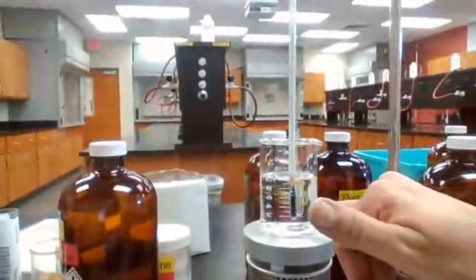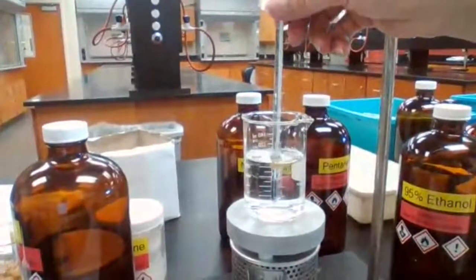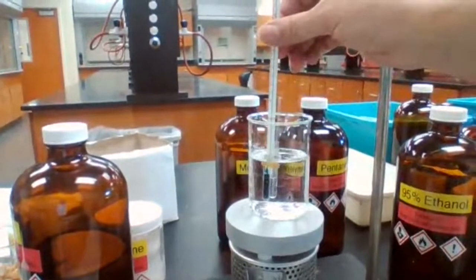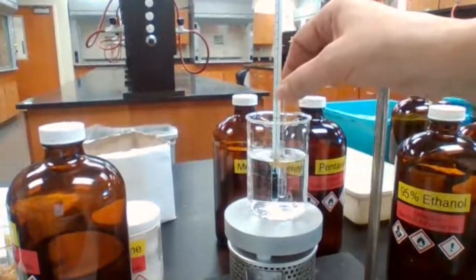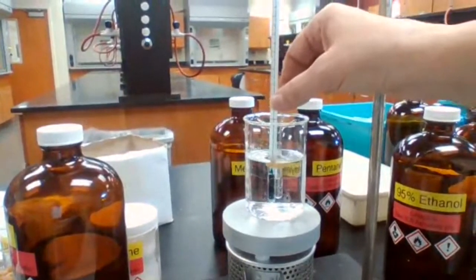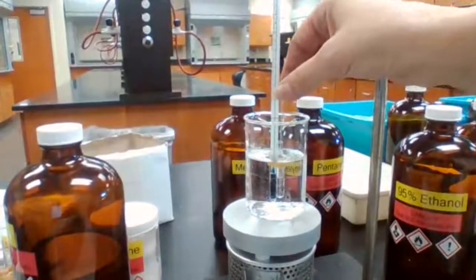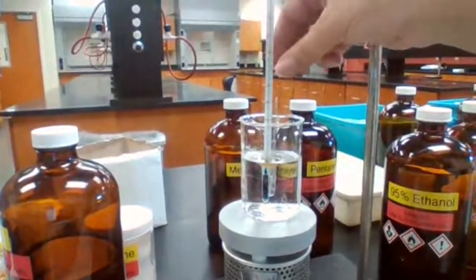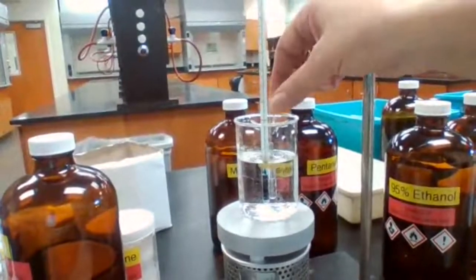So do you see this capillary tube now in here? And I'm going to hold it like this, close, so I want you to be able to see those bubbles as soon as they come out. Now they are actually coming out. Do you see the bubbles? You see the bubbles coming out in the liquid? See? As soon as they come out fast, I'm going to record that number. Okay. You see those bubbles? Please take a screenshot of this. Now you see the bubbles.